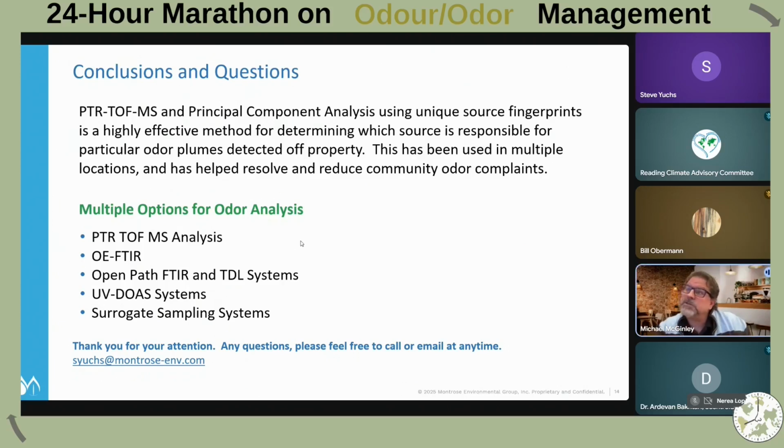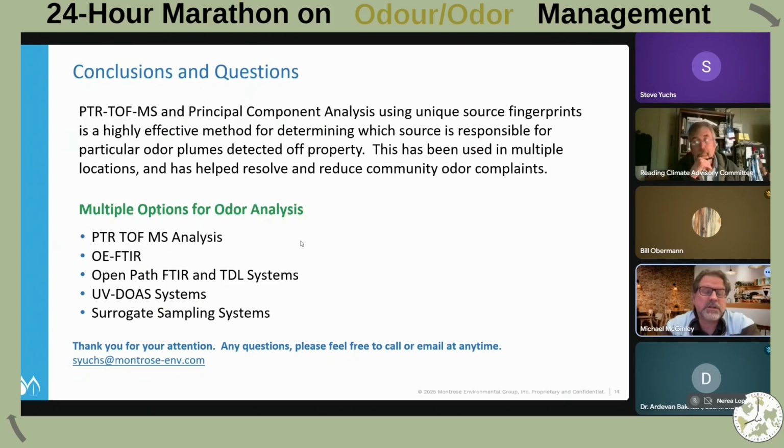I'm looking at chat. There's a little bit of delay, so let's see whether we have questions there. I mean, I think this is really interesting. It's fun to see these high-end mass spec systems. There's a couple of them that commercialization is increasing on, and putting them in a van adds a whole other layer of usability. Significant project work to do, but it really does kind of show a future of chemical analysis.